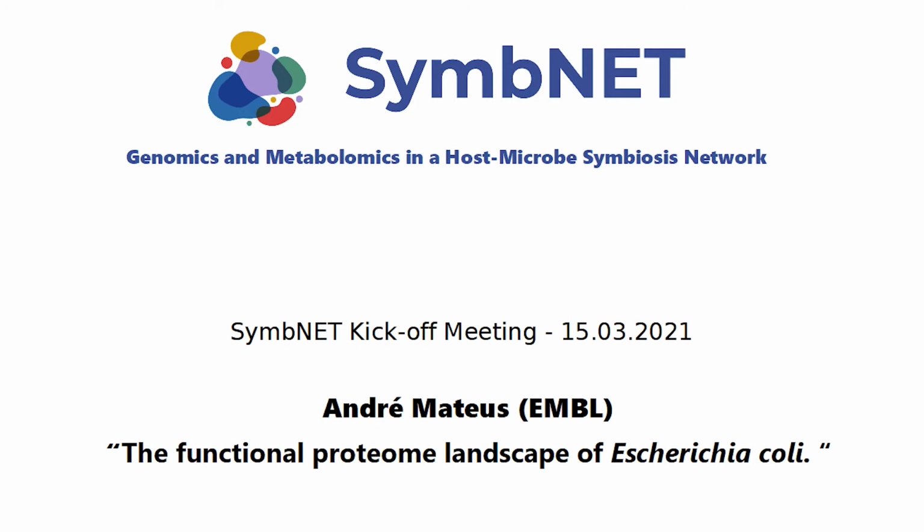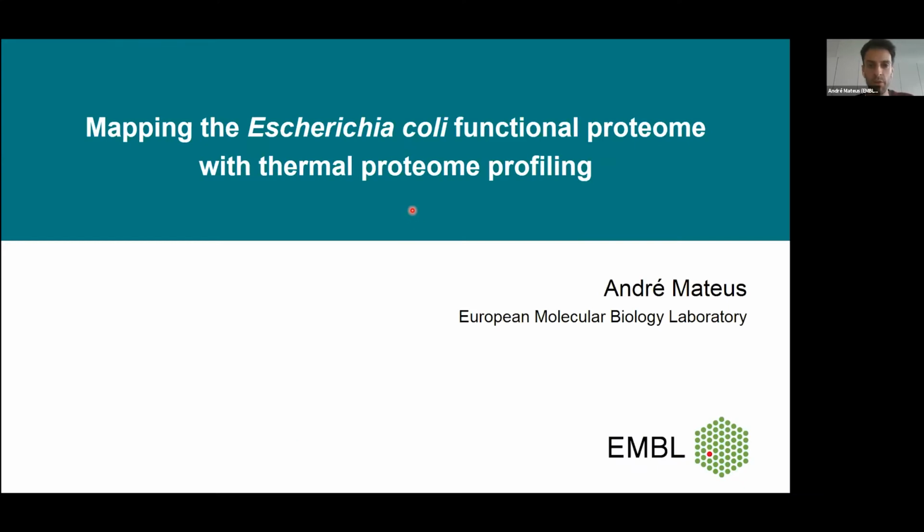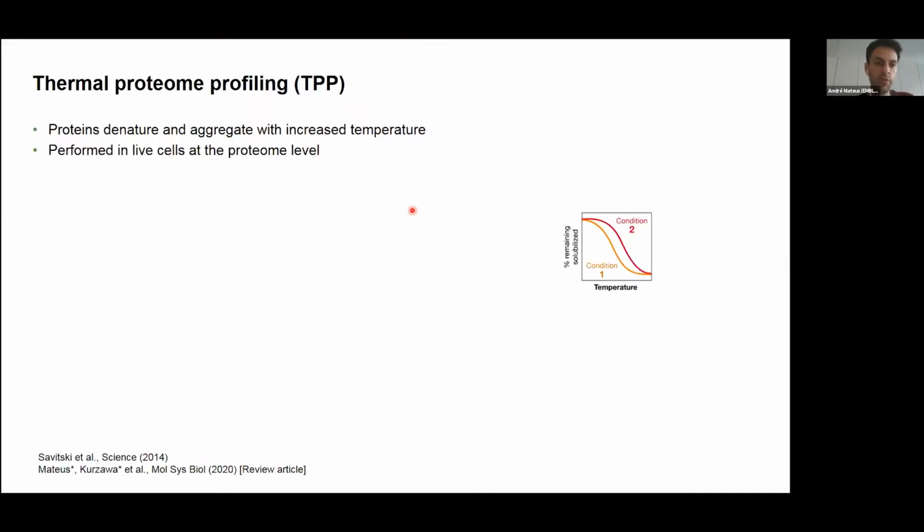So I'm going to be talking about work that we've been doing to map the E. coli functional proteome using thermoproteome profiling. So let me start by explaining what thermoproteome profiling, or TPP, is.